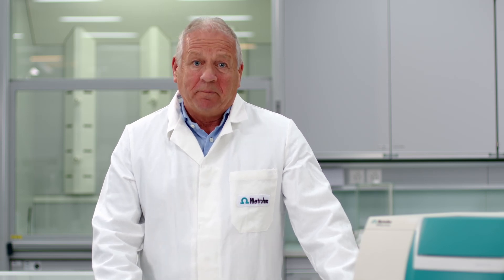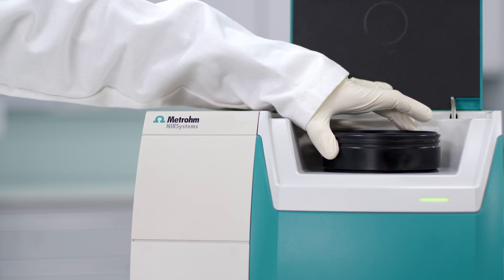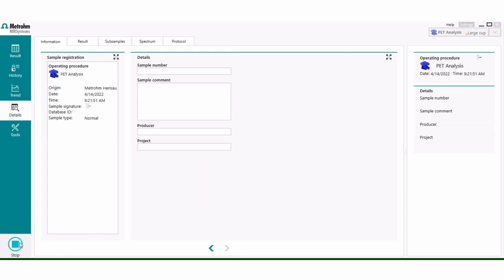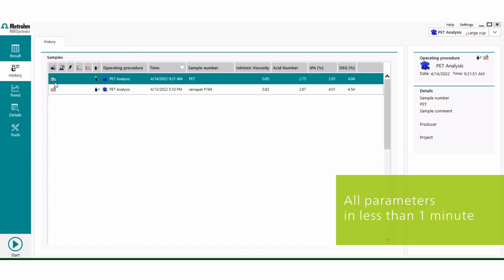So how do you measure a sample? It's simple. Just position the sample in the appropriate container on the DS2500 solids analyzer and close the lid. Now you only need to select the corresponding operating procedure and hit the start button. In less than a minute you get results for all the calibrated parameters.